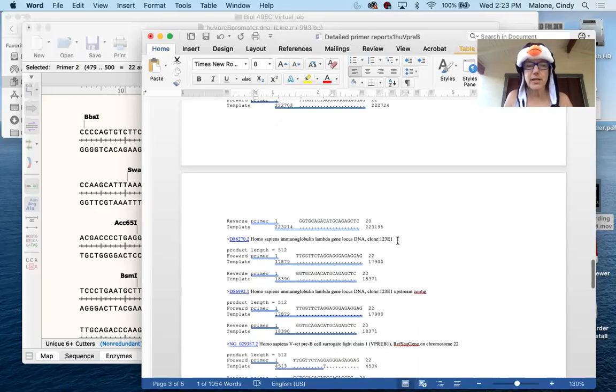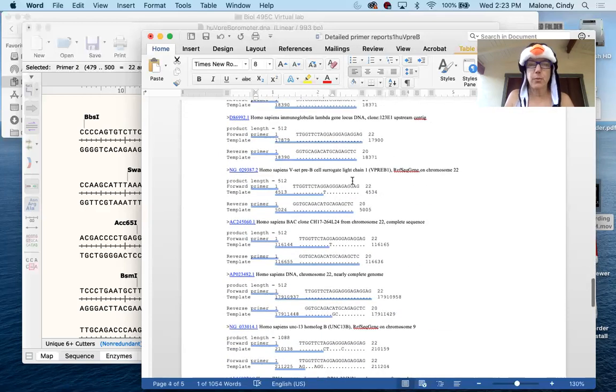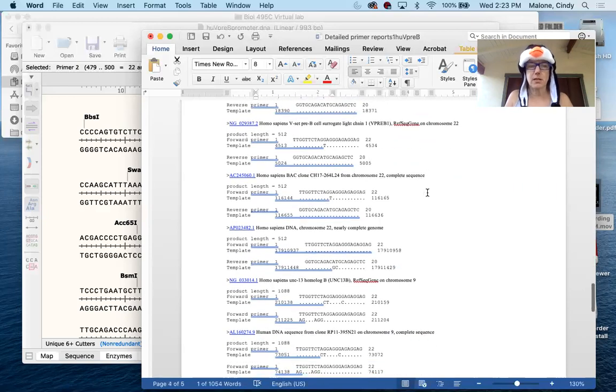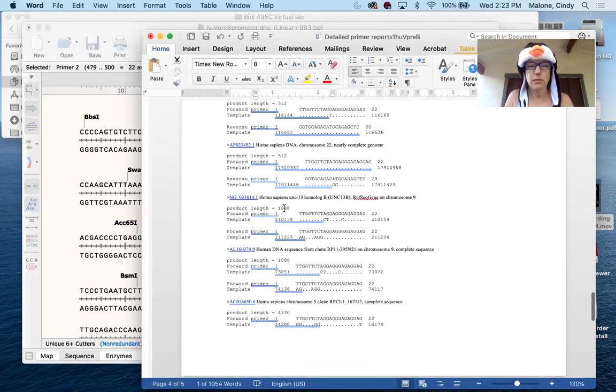So all of these guys that are the immunoglobulin locus, that's all my V-pre-B guy. Okay, so this is me, this is me, this is all me. Aha! Here's one. That is not me.